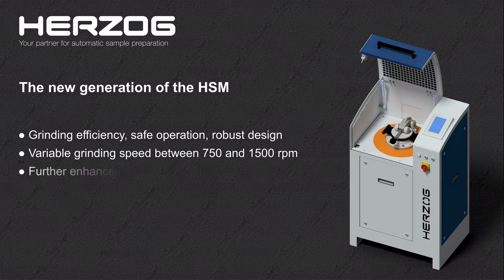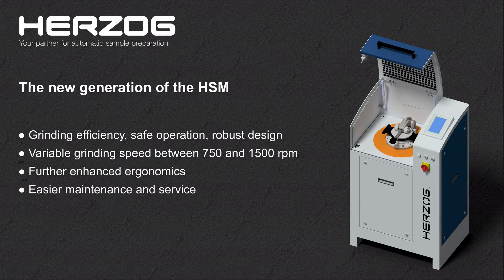The ergonomics of the machine have been further enhanced due to a more comfortable working height, a larger grinding chamber and a broad carrying grip on the grinding vessel. The increased inspection hatch and machine room make maintenance and service activities easier. The new large 7-inch panel allows easy and intuitive access to all machine functions.